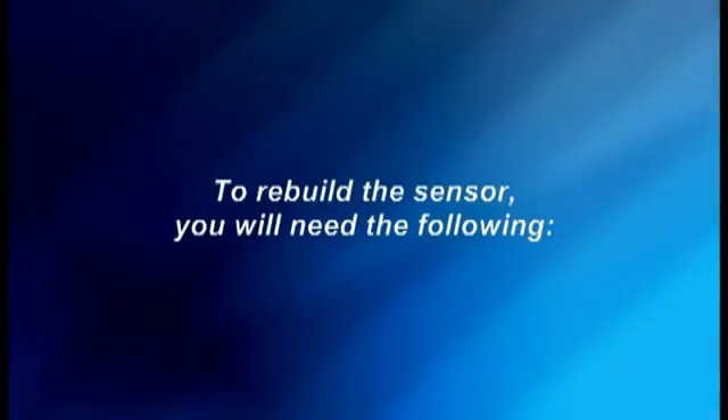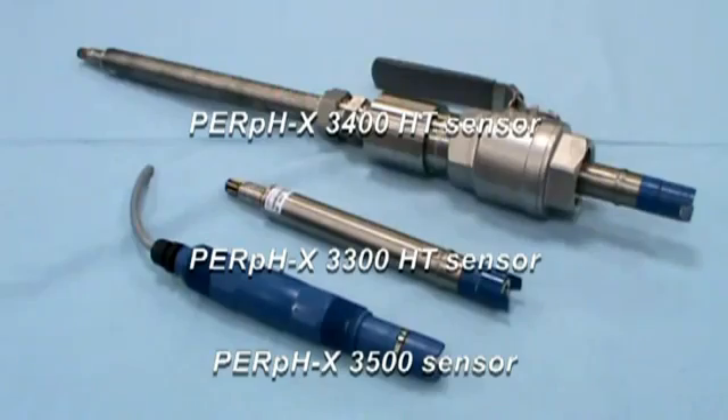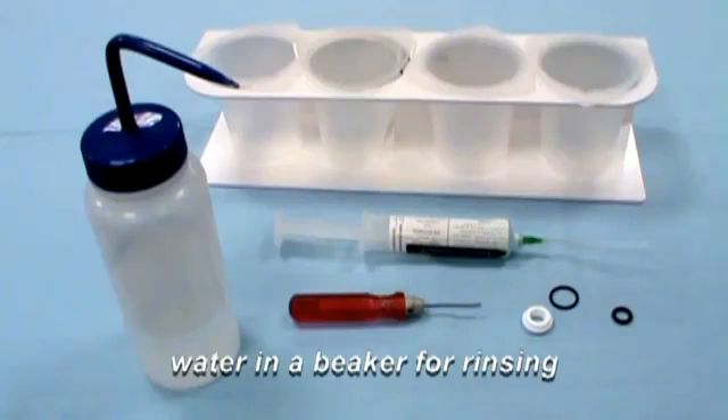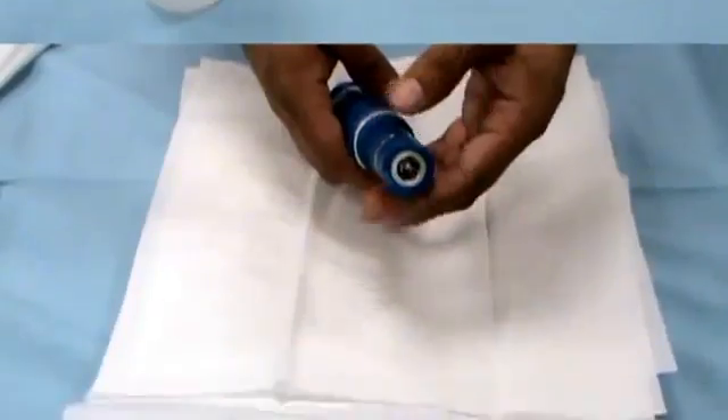To rebuild the sensor, you will need the following: a PERpH-X sensor, a PERpH-X rebuild kit, water in a beaker for rinsing, a small screwdriver, and a squirt bottle.